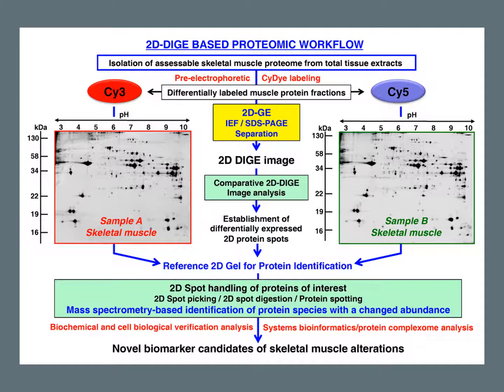And this is just the labeling where you're basically doing the same amount of work in one gel. In the blending of the fluorescence, you could have an exact image, and they can be overlaid, and you know exactly what each spot is in common or what spots are different. Here's one that's very high, and this is not so high here. Okay, just one thing that I saw.